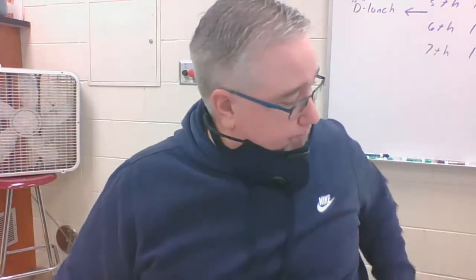Now I've also got a beaker here with some distilled water in it. I'm going to set that up. I don't want to put that on my computer. And in the beaker, I'm going to put some iodine.